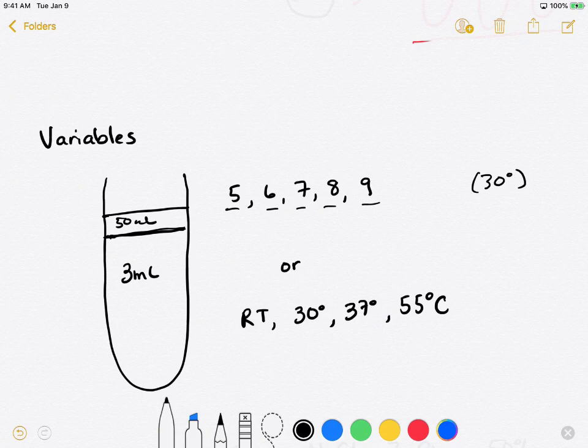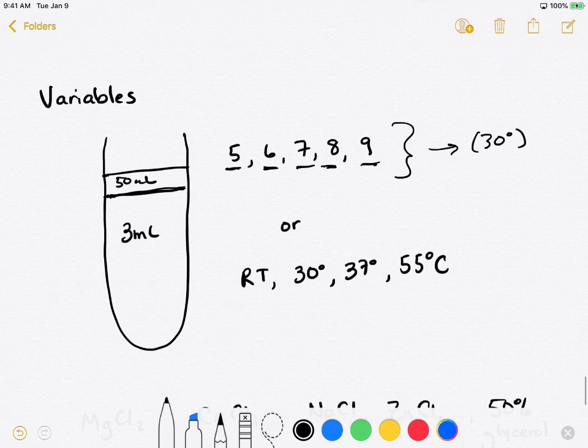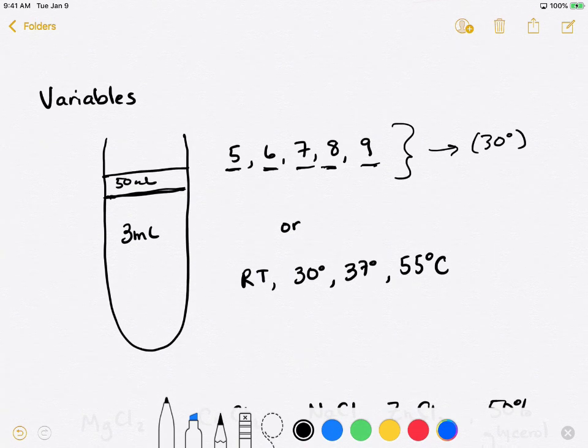If you had decided to test the effect of pH on your enzyme production, then what you did was you took the samples at the various pHs that already contain these different pHs, and you grew up these samples at 30 degrees to see what would happen. If you were interested in seeing the effect of temperature, what you did was you took your 3 milliliter culture plus the 50 microliters of bacterial suspension and you placed it into one of 4 different temperatures to see what would happen.